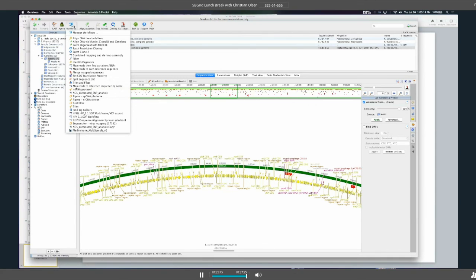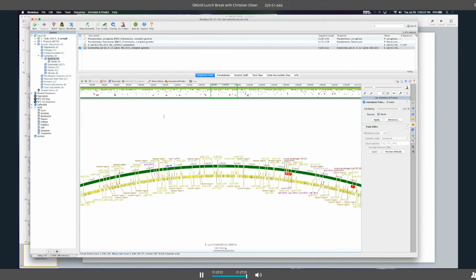Yeah, so that is on my list of things to do for version 10. This is something I thought about one version ago, but it's not trivial to do: to set up a workflow community as a resource where you could go to our Geneious support site, look up NGS workflows, download a workflow, and then tweak it. Okay, so that's my grand scheme to take over the world.